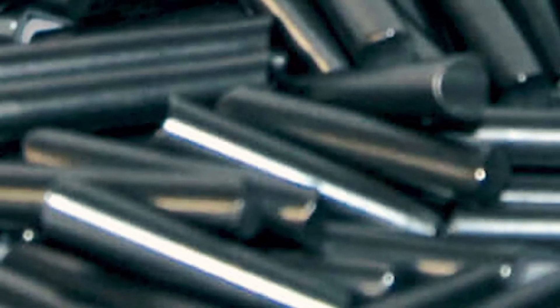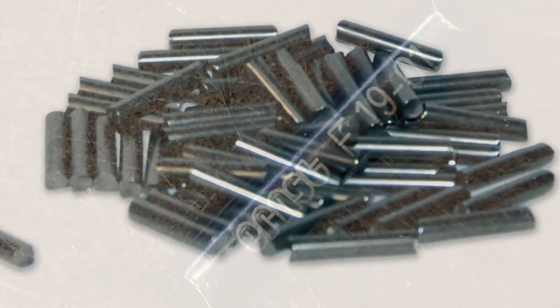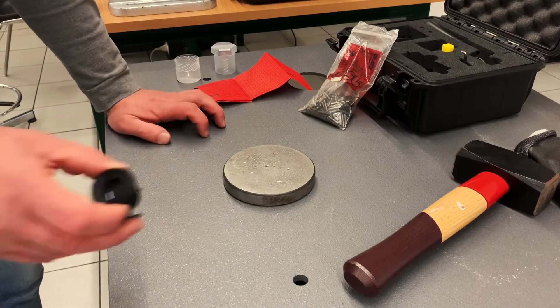Chisam Ernst, owner of the Ernst patent, is the only manufacturer of the calibrated pins and of the relative conversion tables between the measure of the generated impression diameter and the Brinell hardness value.